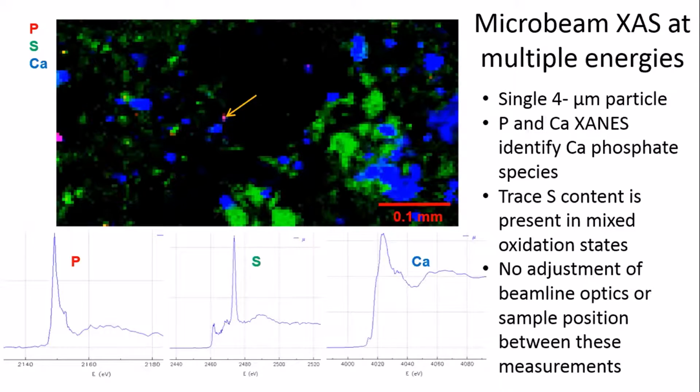These measurements were made with no adjustment to beam optics or sample position. We just dialed up those energies and made those measurements on that spot while sitting there.